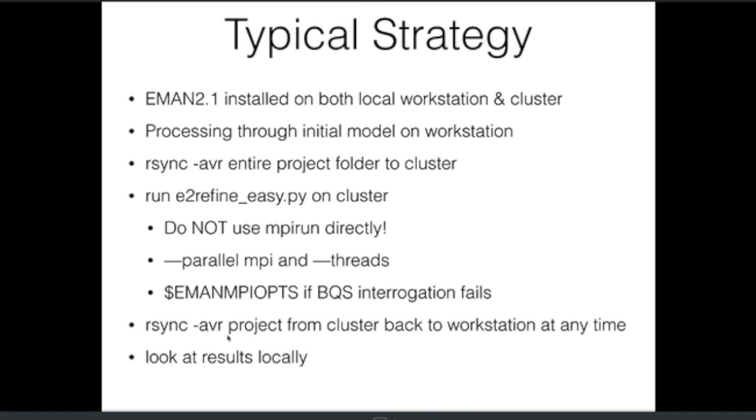Then while the job is running or after the job finishes, you can just rsync -avr your project back from the cluster to your local node, or if you have a shared file system, you can just access it directly. And then you can visualize what's going on and look at the results back on your local workstation. While you can find environments where they've set up remote OpenGL visualization directly from the cluster, I've found that those situations are unusual rather than the standard environment. Generally speaking, you'll get much better performance if you just do stuff on your local workstation. Since we use OpenGL for all the graphics, getting it to work across the network connection is always a little bit of a pain. So this is sort of our general strategy.